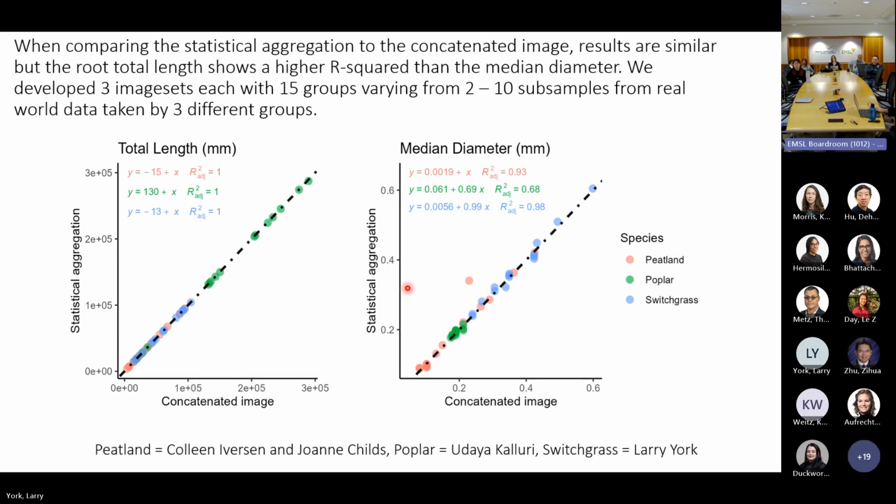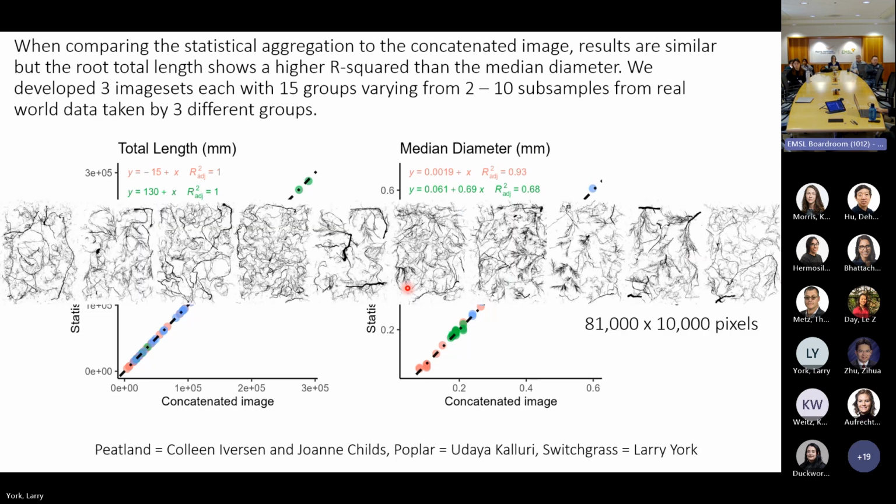We're planning to release this to the community so that they have options for how to handle this. Because what I had seen, when I literally walked into the office, was a postdoc sitting there with Excel open, trying to link things together to get the additions. And what happens is that people, because they only knew how to do links, are ignoring all the other data. But like I said, I tend to think of everything as multivariate, and so I want to make sure that we keep the multivariate features through the pipeline.